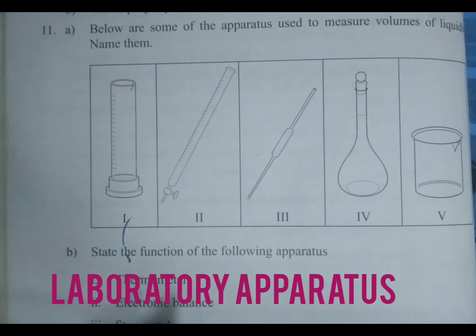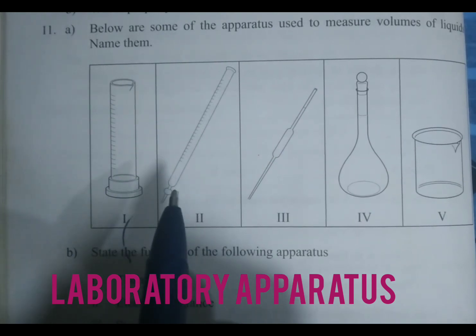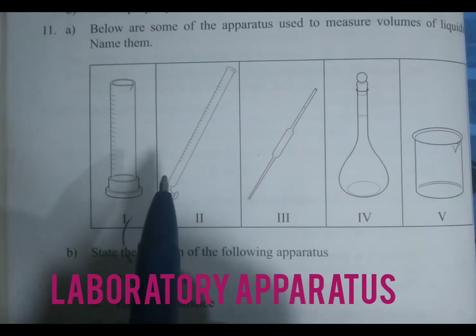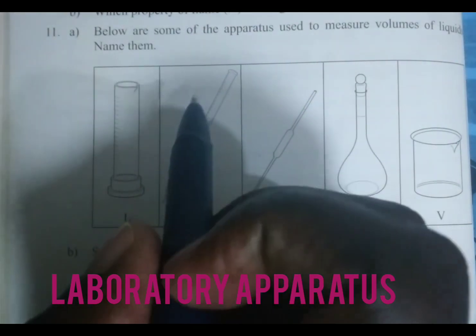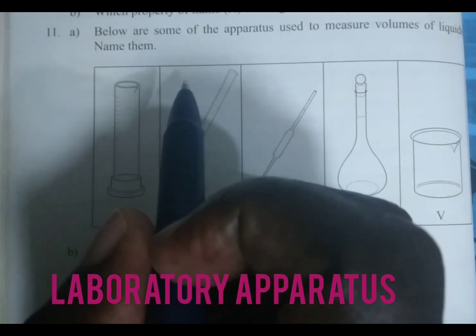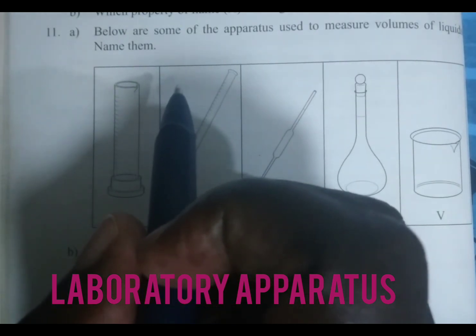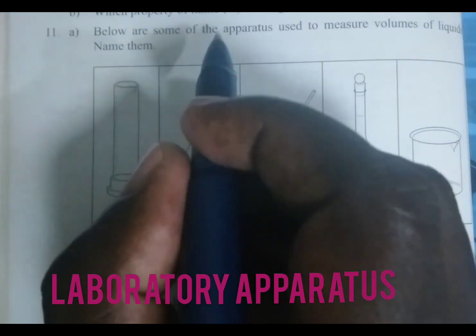This is Chemistry Form 1 under the subtopic Laboratory Apparatus. Laboratory apparatus are those equipments that we use to carry out experiments in the lab. We said in our discussion that laboratory apparatus are classified according to their functions.